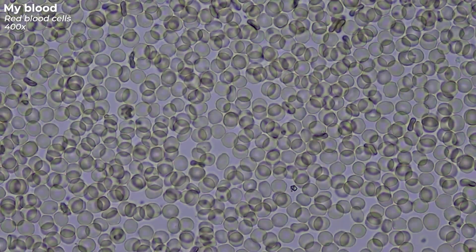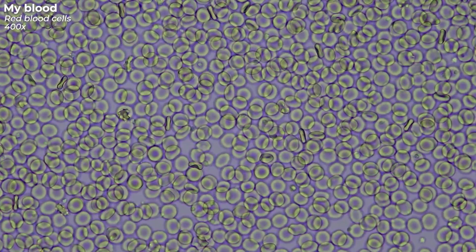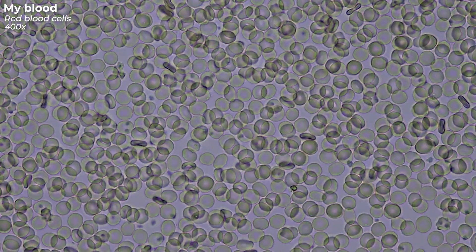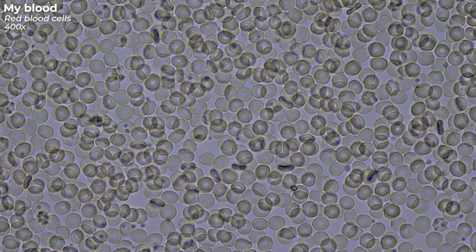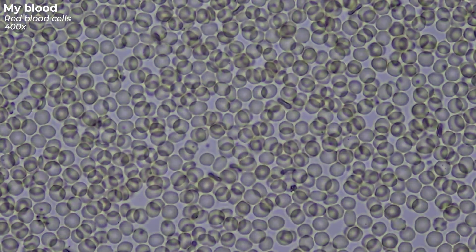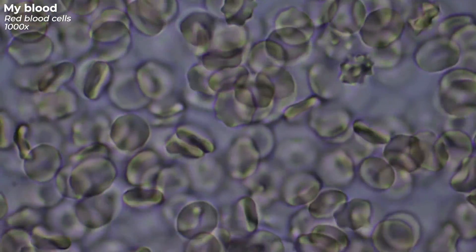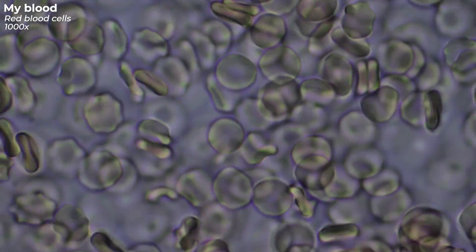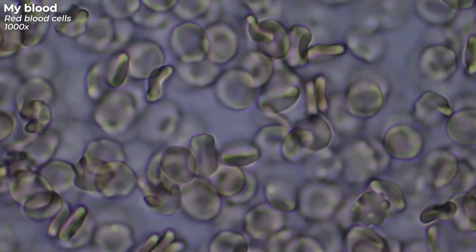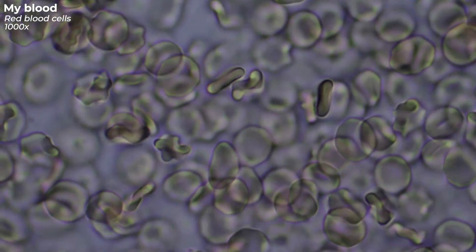Erythrocytes have a biconcave disc shape, so they appear slightly paler in the center than at the edge. The shape makes them flexible, allowing them to be deformable, so that they can enter and move through even the smallest blood vessels. Red blood cells are formed in the bone marrow and circulate through our body for an average of 120 days, until they get removed and replaced with new ones. Their main task is the transport of oxygen. The oxygen is bound to the iron-containing pigment hemoglobin, which makes up 90% of a red blood cell. They get oxygen from the lungs, supply your muscles and organs with it, and in return carry carbon dioxide back to the lungs, where you exhale it. This entire process is also called gas exchange.